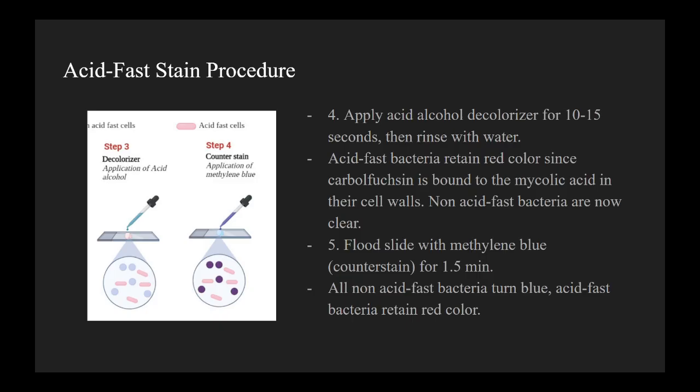Okay, so after we do that, we'll let that sit, and then we'll do the decolorization step, right? We're going to use acid alcohol, and then we're going to decolorize for 10 to 15 seconds, then rinse with water. And what's going to happen is that the acid-fast bacteria, remember, have the mycolic acid in their cell walls, and carbolfuchsin will actually bind specifically to mycolic acid. So once you do the mordant and the fixation and everything, the carbolfuchsin will stay in the acid-fast bacteria, but it won't be permanently bound to the non-acid-fast bacteria because they don't have mycolic acid.